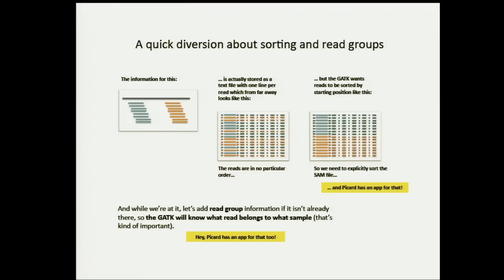In that case, it doesn't matter to you if you're seeing the same molecule being read over and over because you just want to see how the machine read that particular molecule or any molecule. You want to see if it always makes a mistake after reading A, C, G, and then after the G, it's always going to read an A, for example. For that kind of analysis, it really doesn't matter if you're reading copies of the same molecule. But this is a very specific case.